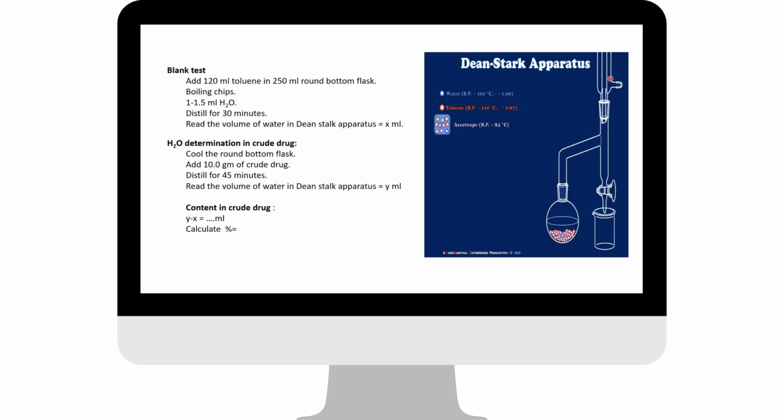In the condenser, here is the water inlet, from where the cool water will pass, and the hot water exit is also there. The hot water will pass out from the condenser.